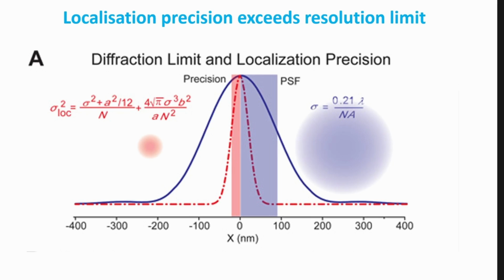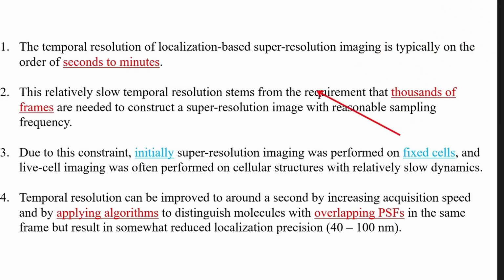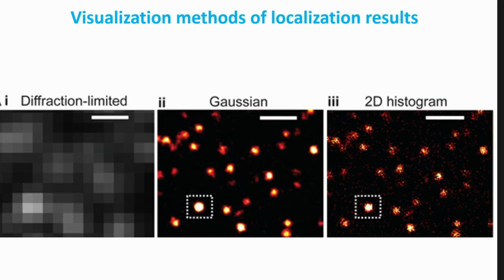So now we see a method where the emission side point spread function was manipulated. Can I do further? Yes, you can combine excitation side instead with emissions. There are many combination methods where one methodology is combined with some of the others. And one of the most popular ones is structured illumination microscopy. And this is just a summary.